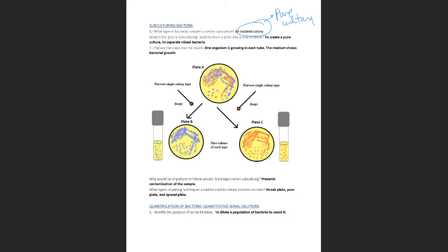So yes. Ideally, you're supposed to wait until the entire plate has solidified. And it's kind of an overkill. If you think it takes 10 minutes for it to solidify, you wait 15 minutes just to make 100% sure that it's been solidified.